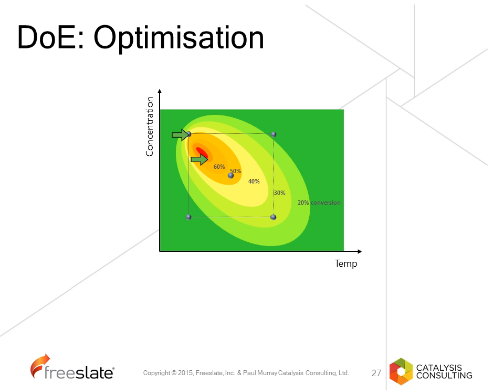And so we will get this as a prediction from the experimental design. And from that prediction, then, we will have a reaction that works much better, and we will have the maximum for that true reaction. So at this point, you can lie back, put your feet up, and predict hundreds of results from many, many experiments.